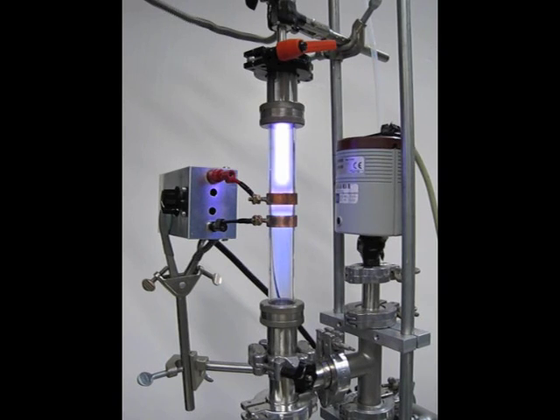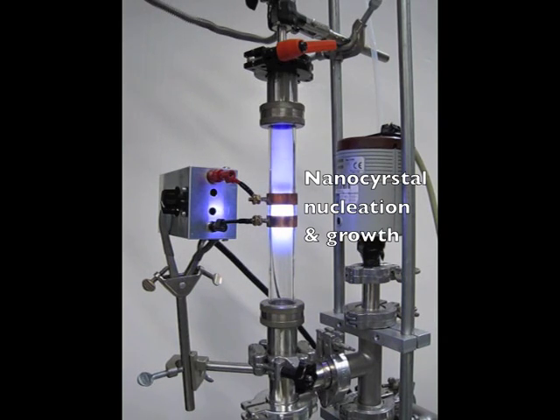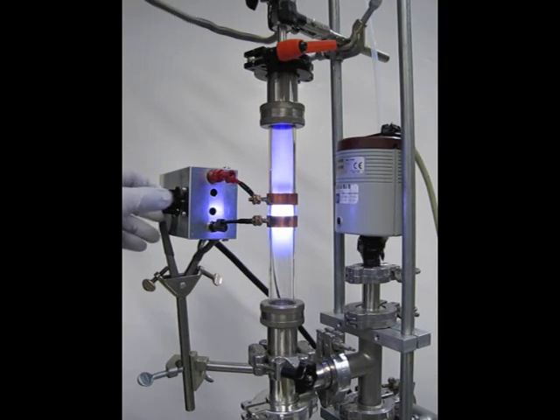Now we have a very reactive environment in which we can do chemistry. When a reactive gas is introduced, in this case silane, the gas molecules are broken down and reassembled in nanocrystals. You can actually see the plasma change as a result of this process.